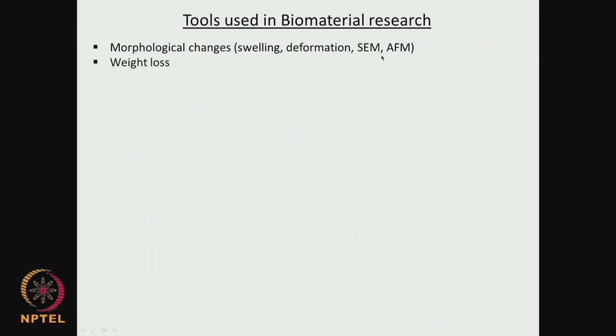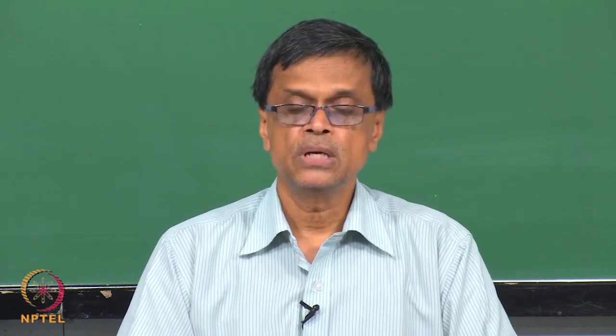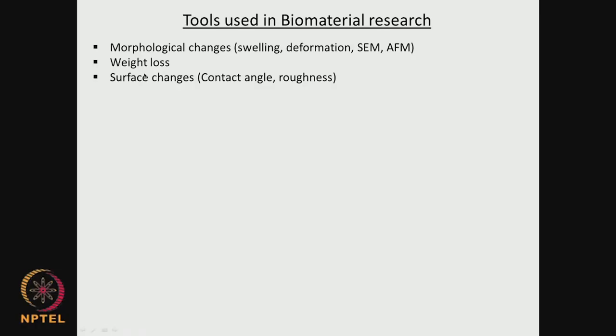Then we are looking at weight loss. Suppose there is a degradation or resorption of the material, you would like to see whether the material has lost its weight. If it's a drug delivery system, you want the material to actually lose weight due to bioresorption. Then there are going to be a lot of surface changes on the material. The material may lose its hydrophobic or hydrophilic nature. It may lose or gain surface energy. It may become rough because of being present inside the body fluid. If there is a flow of blood or a flow of urine, it may become rough. Is that going to have any effect? So we need to study that.